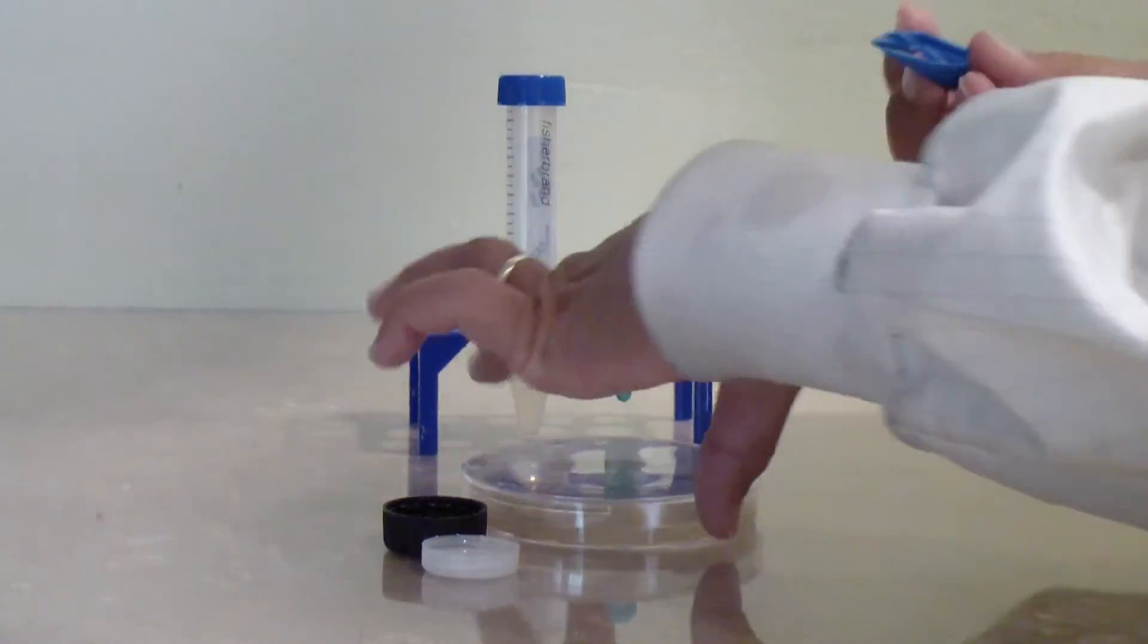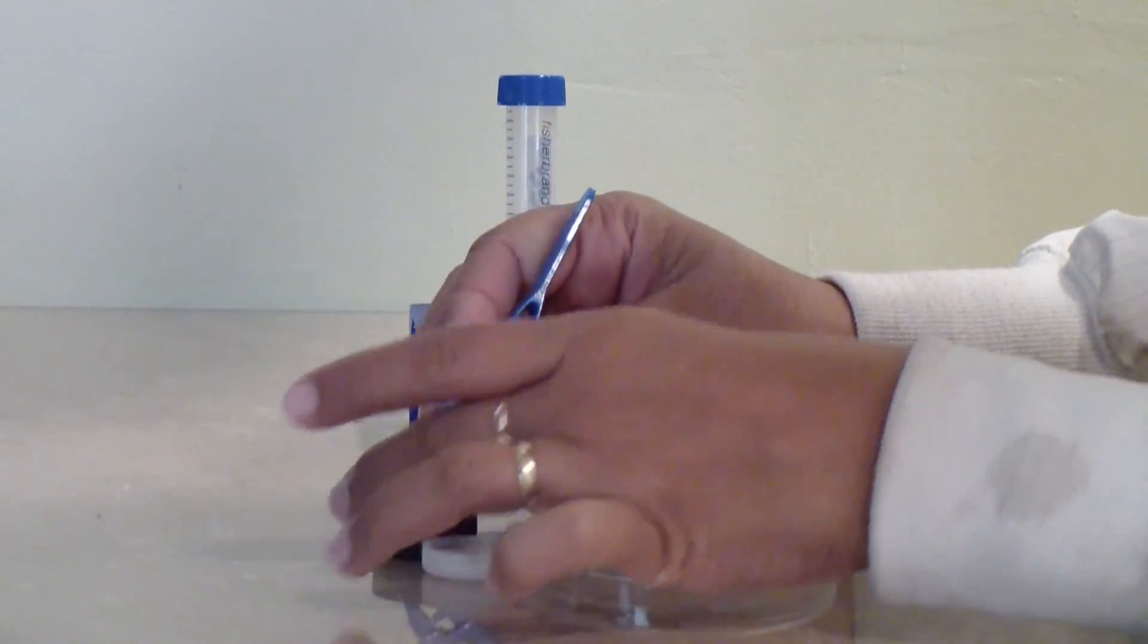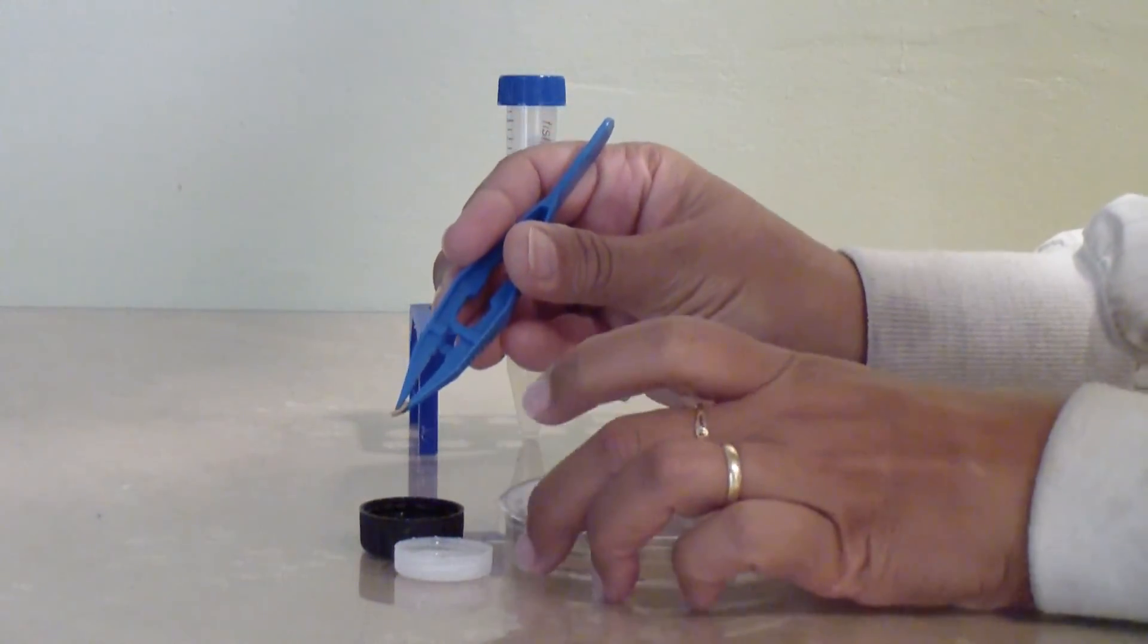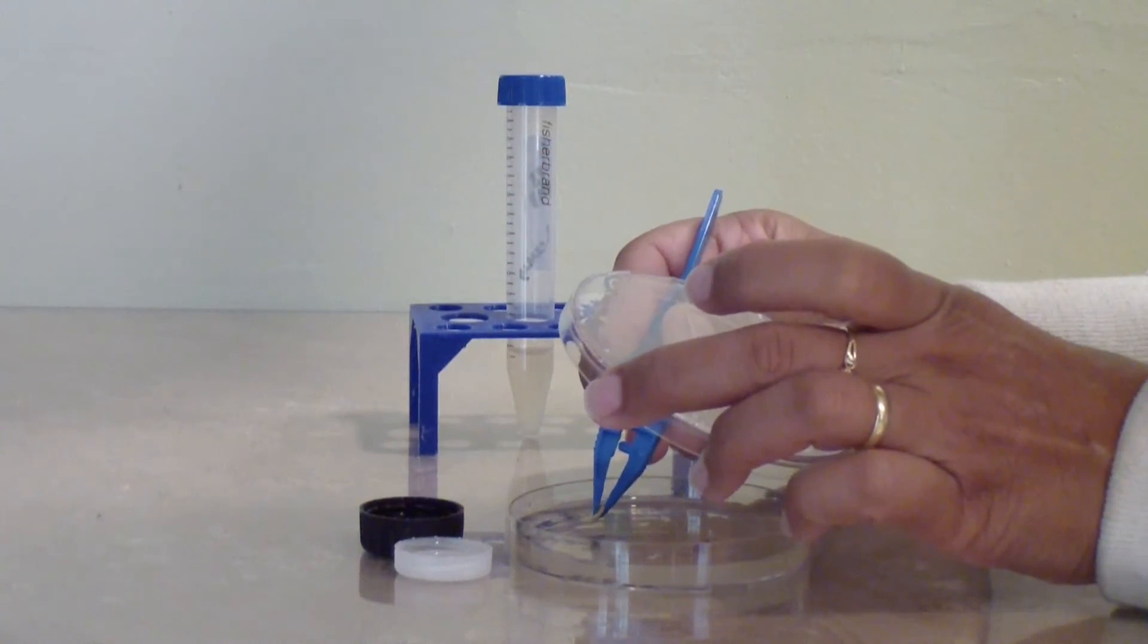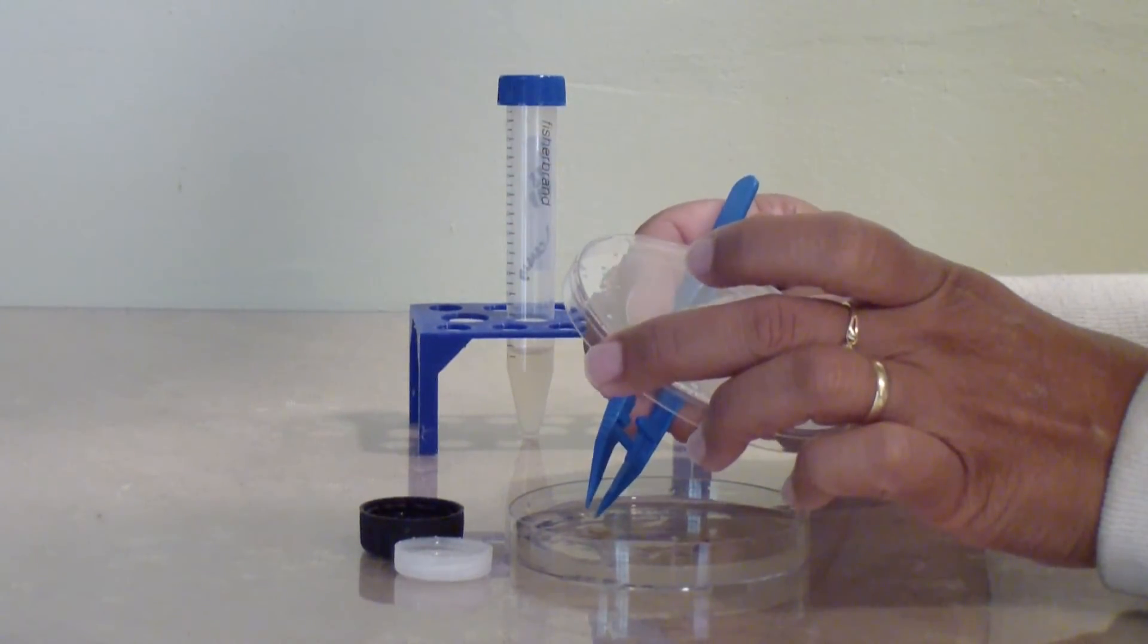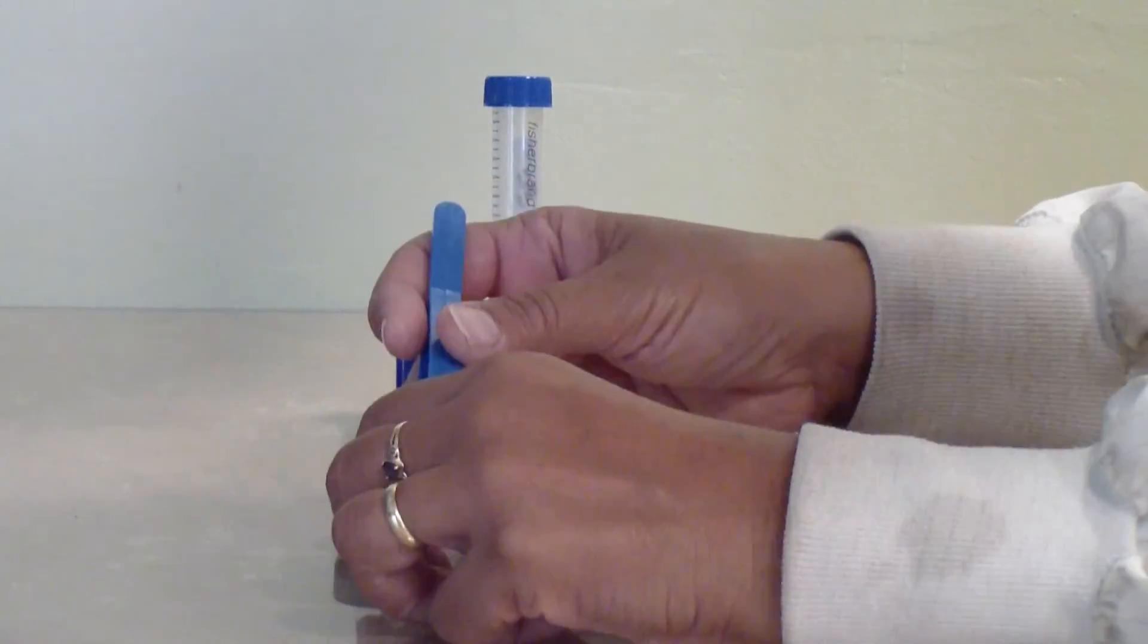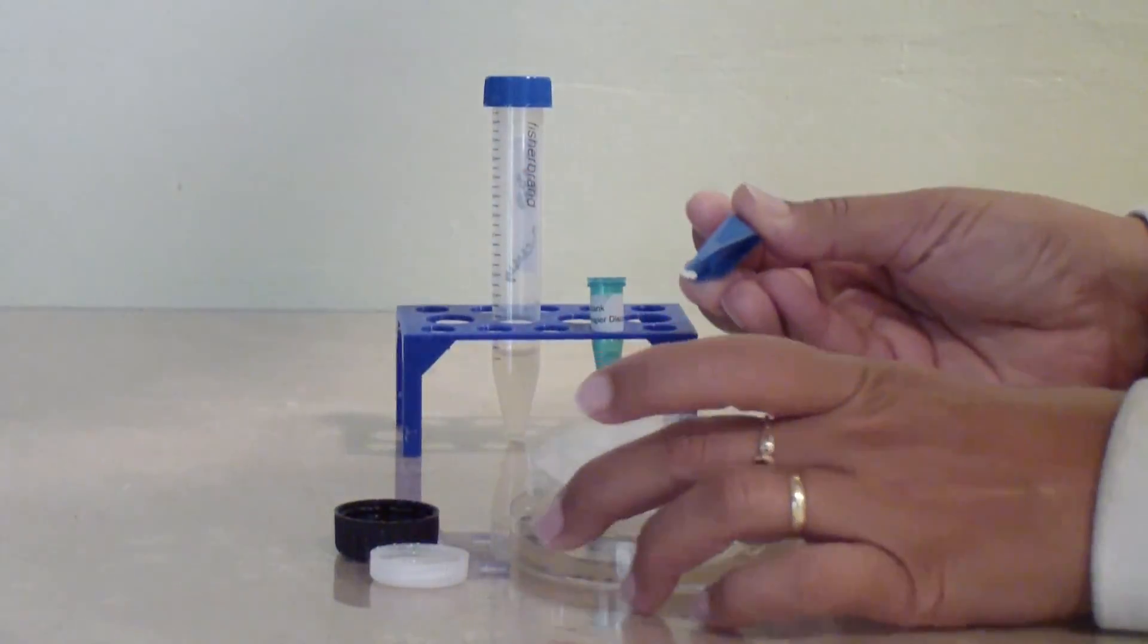With the forceps, place a disc onto your plate right on the spot indicated with the dot. Use the tip of the forceps to press the disc gently down onto the surface of the agar. Place the remaining discs on their designated spots.